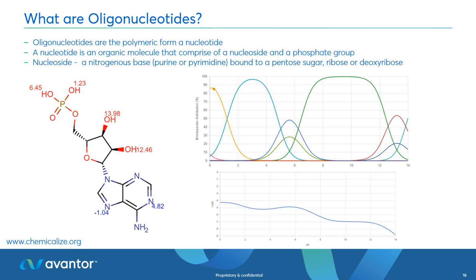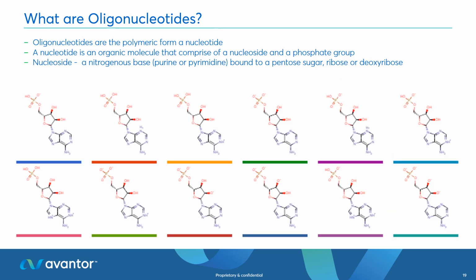On the previous slide, we looked at the log D, and we also saw a plot of those different components. This slide shows those components, but now we can actually see what the structures are. And we can see that each of these structures in themselves, from an electrostatic perspective, are quite complicated. We have multiple charge states.